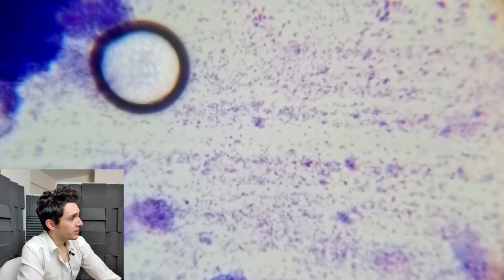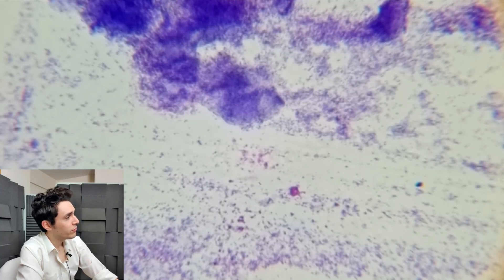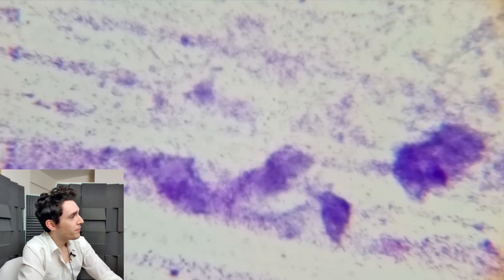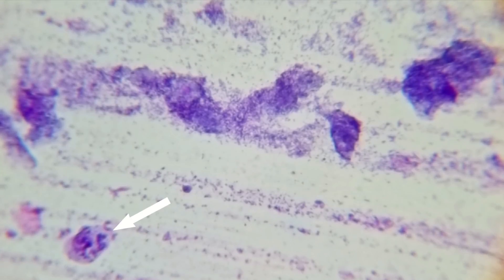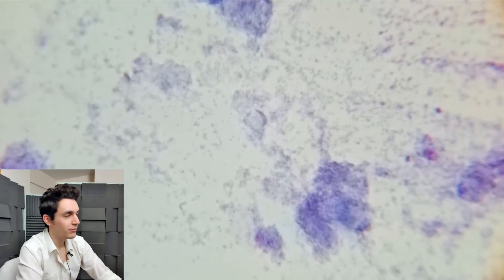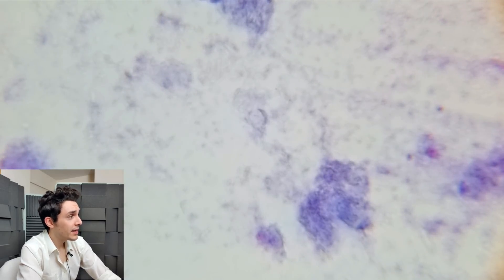Just lots of cellular debris and skin cells that haven't stained very well, all clumped together — pink-blue dust on the slide and a massive air bubble. The closest thing to a neutrophil I can find doesn't really look like much, just a random blob. I did look at a few other samples with different stains — Wright's stain and an H&E stain — but nothing really showed up.